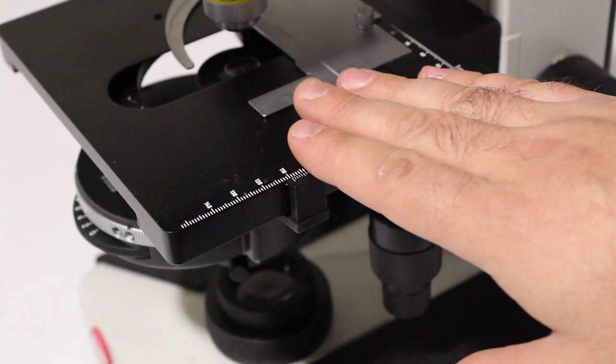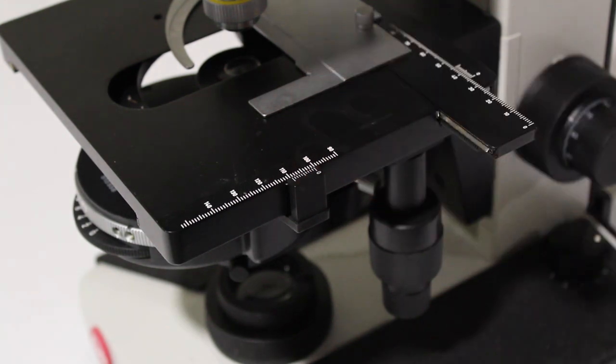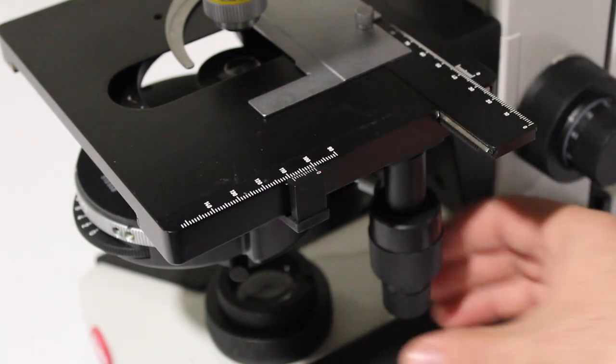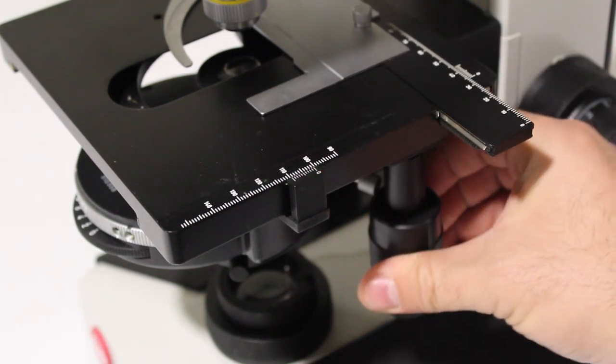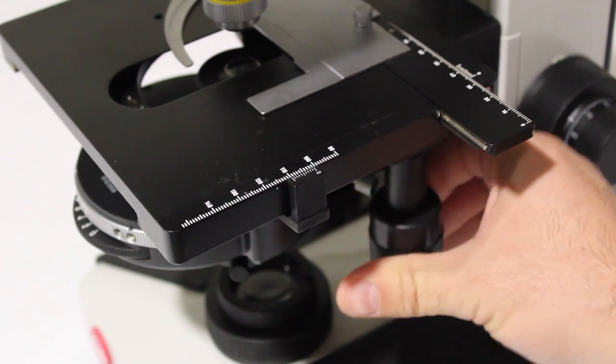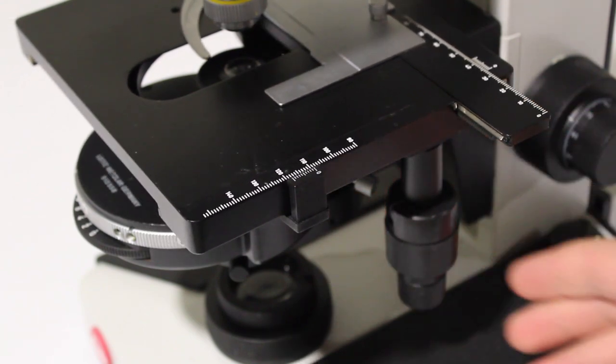This is the stage of the microscope, which is where you're going to place your sample. Stages come in two predominant forms. This is what we would call a mechanical stage, which, as you can see, allows you to position your sample quite accurately using these knobs here attached to the stage.